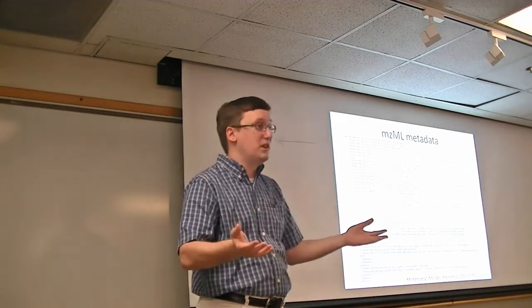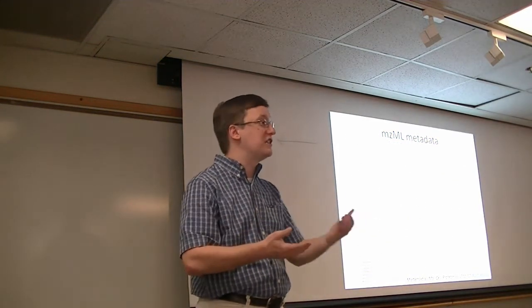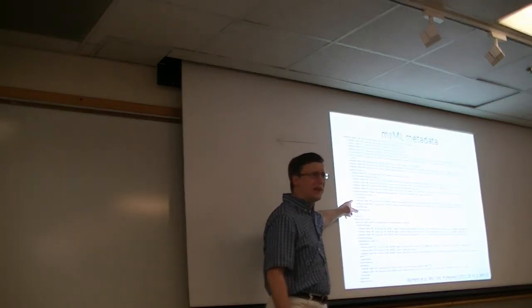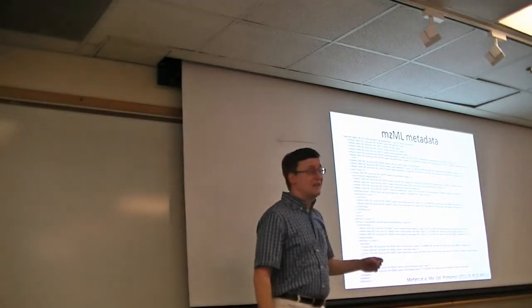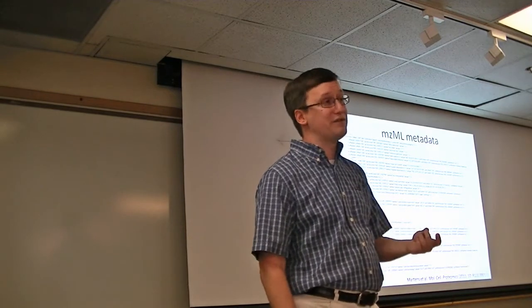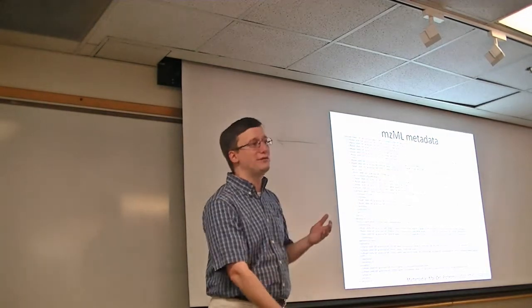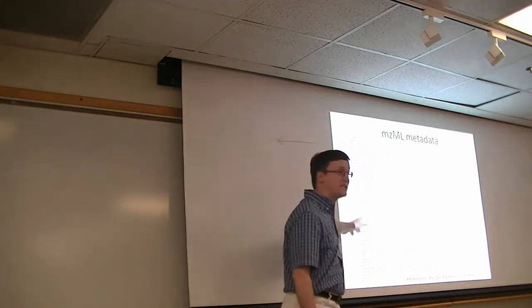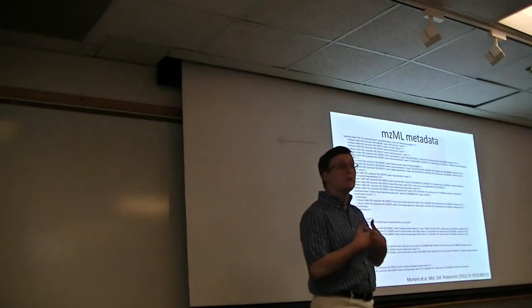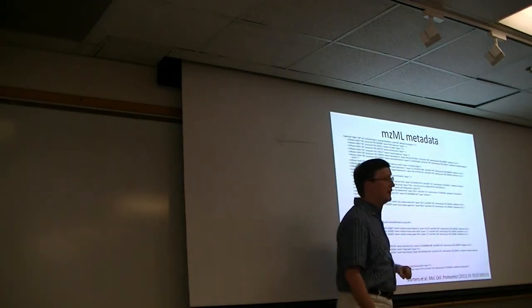And this is true of most of the manufacturers out there. They all have pretty rich formats that are produced by the instruments themselves. mzML has a huge variety of fields that it can represent. In fact, in the last year or two, it's even picked up the ability to record things like ion drift times from ion mobility instruments. So it's a format that continues to evolve over time and give us lots of ways to store lots of information. So we have things like scan start time. You know, if you'd like to know retention times, for example, from within these files, it's valuable to be able to know. You can look right in the file and grab that out.